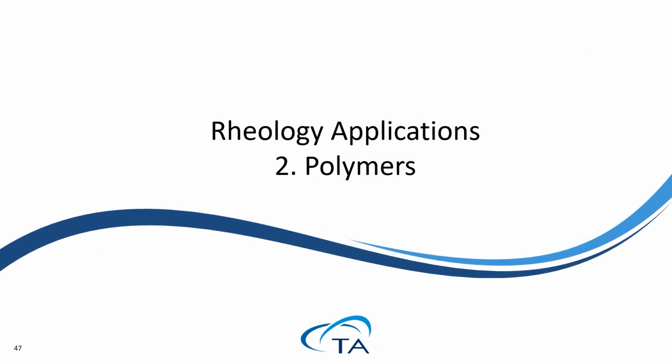So far, we have discussed rheology applications in measuring liquid, semi-solid, and soft gel samples. In this next section, we're going to discuss rheology applications in measuring polymer materials. Specifically, we're going to talk about how rheology is used to measure polymer melts, reactive polymers, and solid polymers.